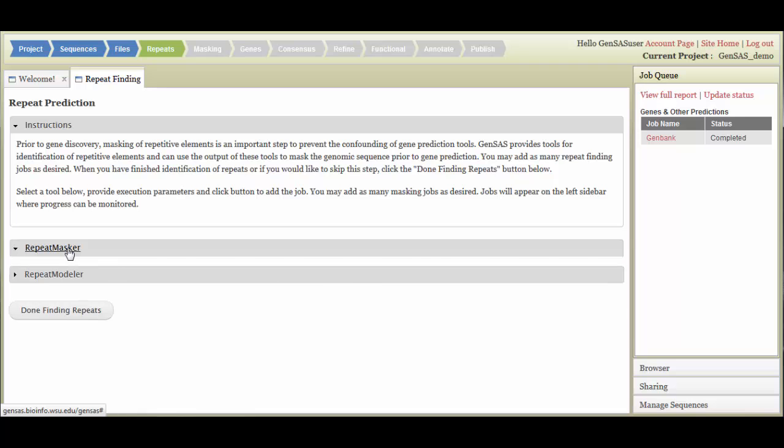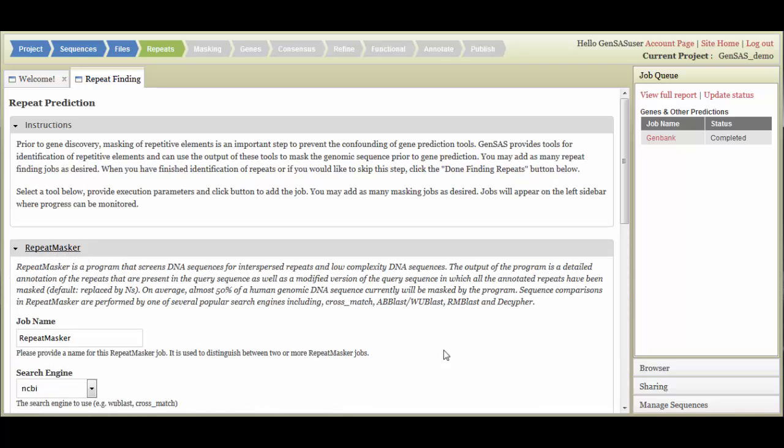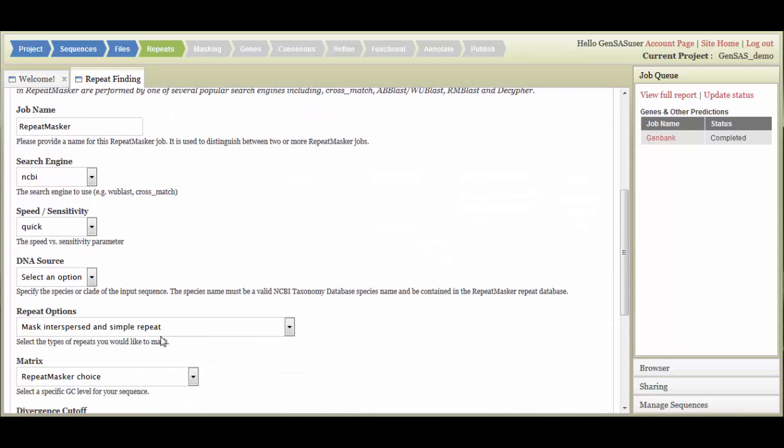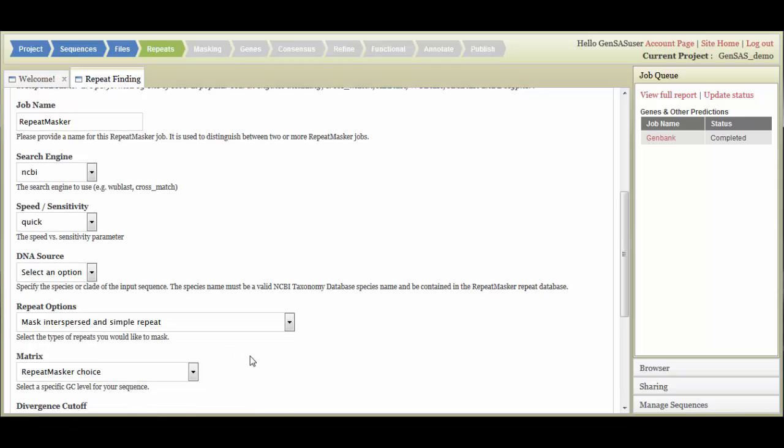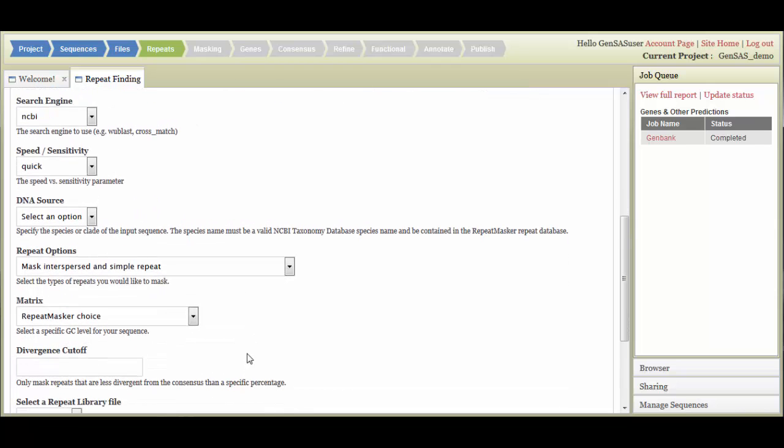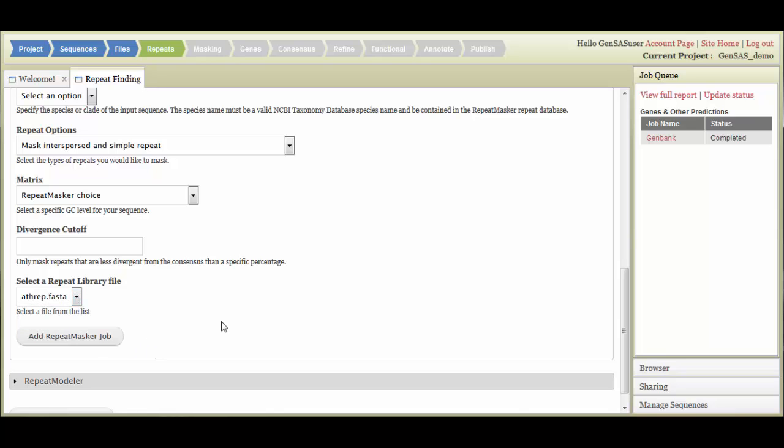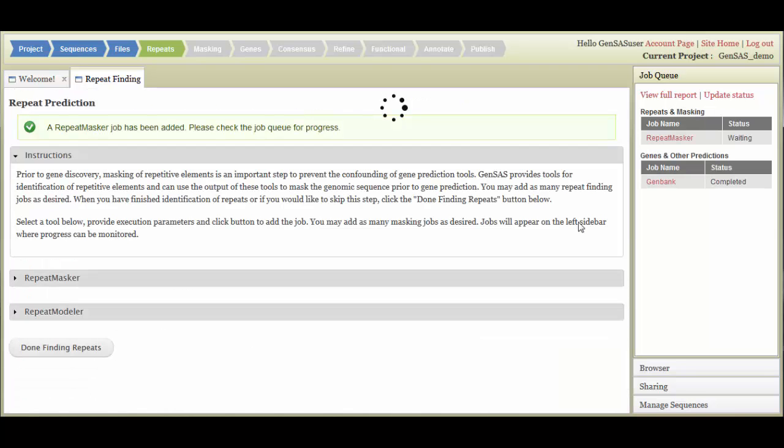For Repeat Masker, there are multiple settings that you can set. If you want to use the Repeat Library that you uploaded previously, go down to the Select a Repeat Library file and select it. Once the settings are as you want them, click the Add Repeat Masker Job button and the job will be added to the job queue.